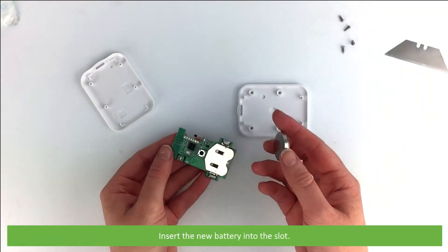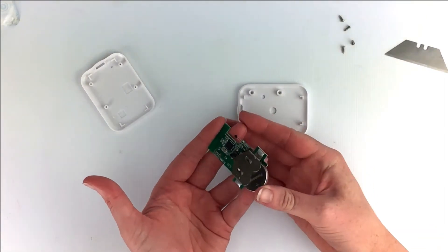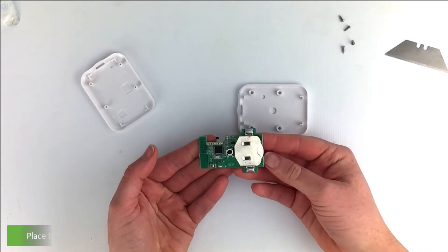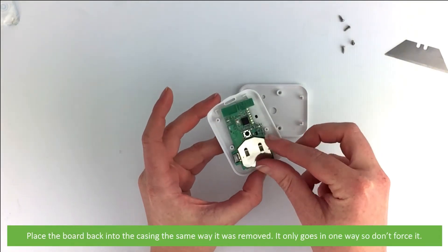Insert the new battery into the slot. Place the circuit board back into the casing the same way it was removed. It only goes in one way, so don't force it.